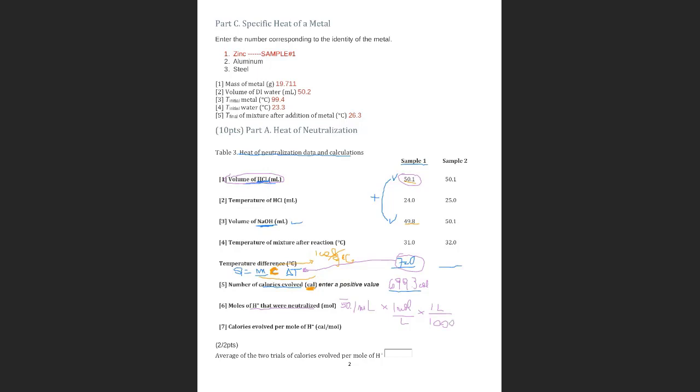But what is important here is that you multiply the volume times concentration of the hydrochloric acid that you use in order to get the number of moles. Does it make sense? Yes, ma'am.